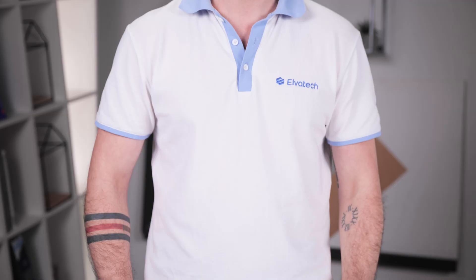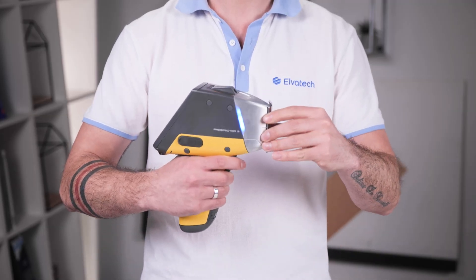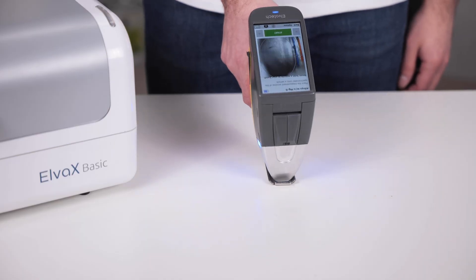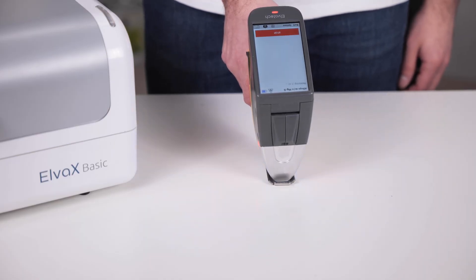Before starting work, you should pay special attention to radiation safety. Never point a turned-on analyzer at yourself or others. Do not measure samples in your hands, and maintain a safety distance of at least 10 centimeters from the x-ray tube.